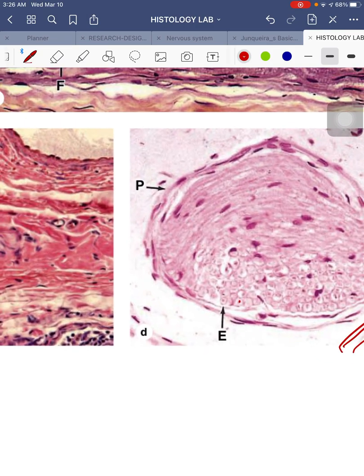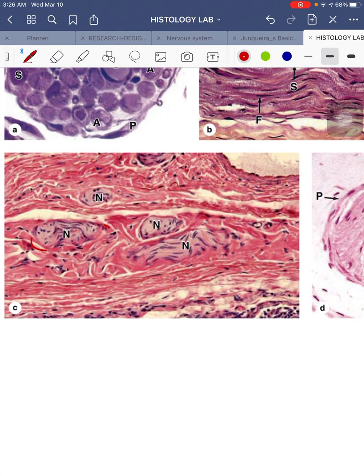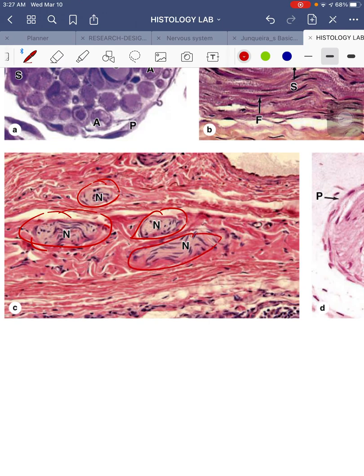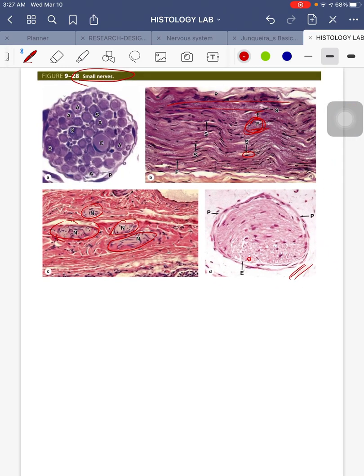This is a longitudinal section of the nerve where you can appreciate the Schwann cell and myelin sheath around each fiber. Finally, when you see nerves in your succeeding slides — for example in the mesentery — they are said to be wavy and tortuous in appearance. The structure labeled N is a nerve. That's all for this week — thank you very much and good luck.